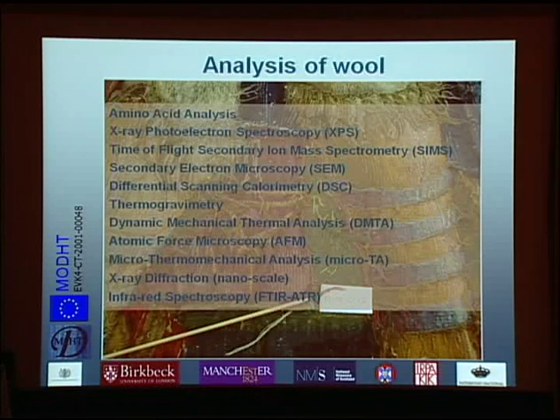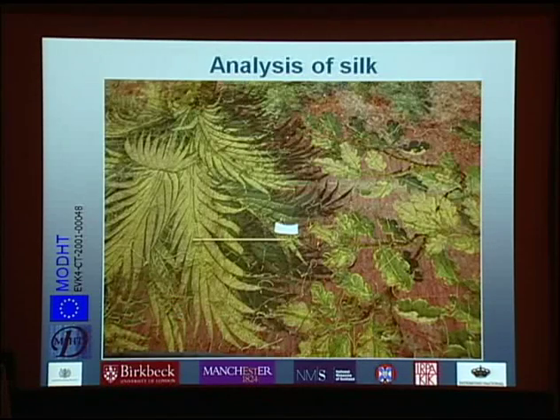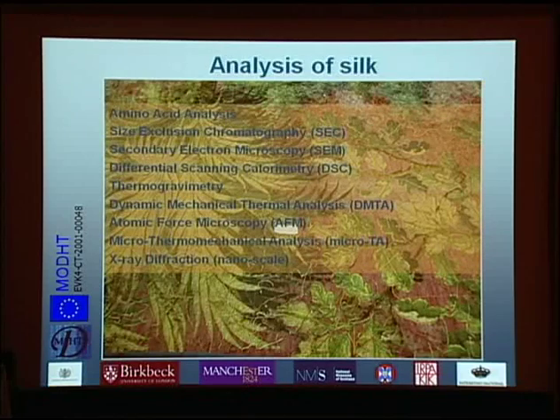This is just an overview of all the techniques that we applied to the analysis of wool, and I will not go into detail. The only techniques that I'm going to talk about today are amino acid analysis, X-ray photoelectron spectroscopy, and infrared spectroscopy, as these were the techniques that we found most useful as markers of damage, and I'll explain why later. For silk, again, we used a whole host of techniques. The 2 techniques I'm going to talk about today are amino acid analysis and size exclusion chromatography.